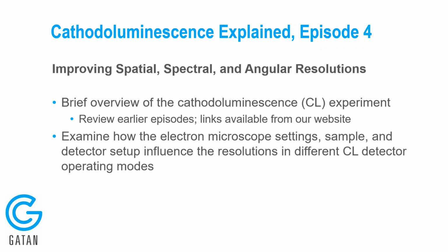So in today's presentation, really we are going to examine how we can use the experimental apparatus used in the CL microscopy technique, the electron microscope and CL detector itself, and how those operating parameters influence the resolutions that we have in various CL detector operating modes. Importantly, we will also have an understanding of how your sample itself influences the data that you collect.